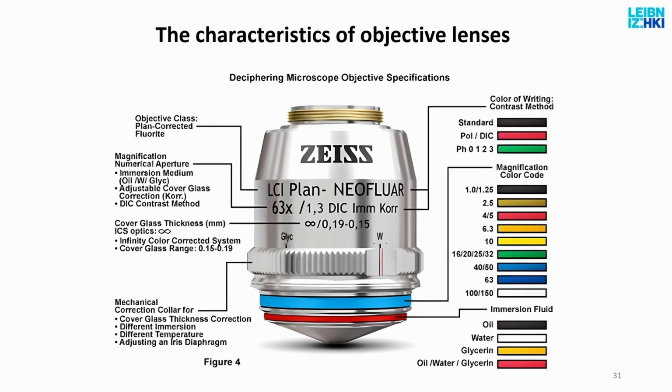Yes, you are compromising. But it's something that, looking at the image, I can realize that there is something wrong. Yeah. You will see, like I said, for example, that the edge of the image will be much more blurred than the center.